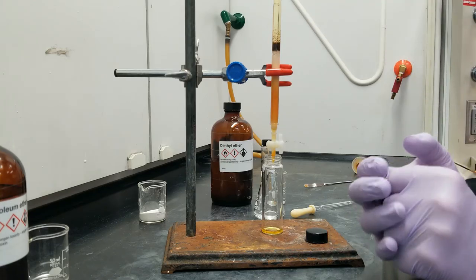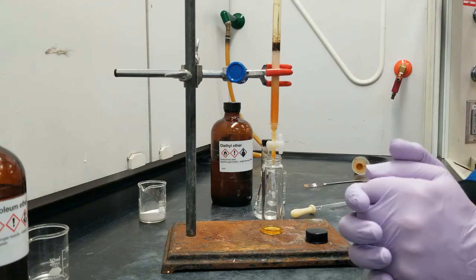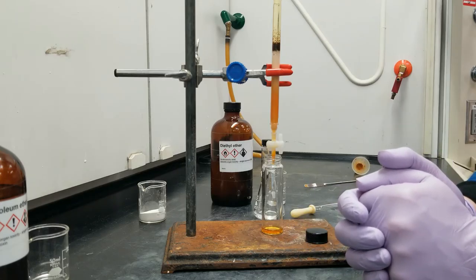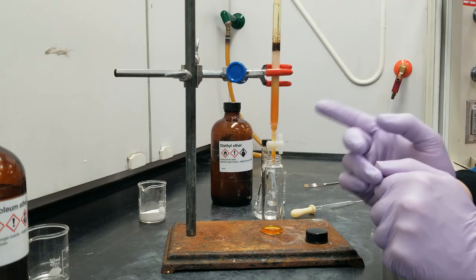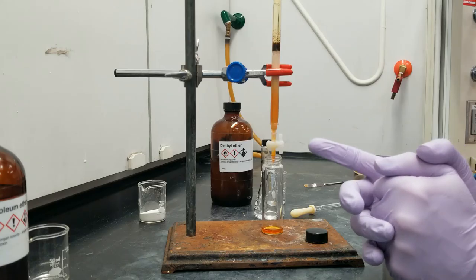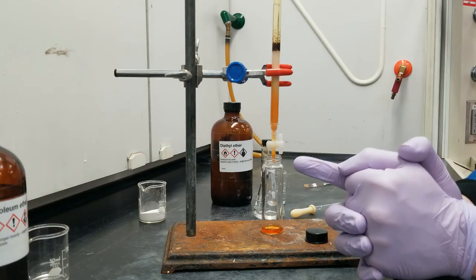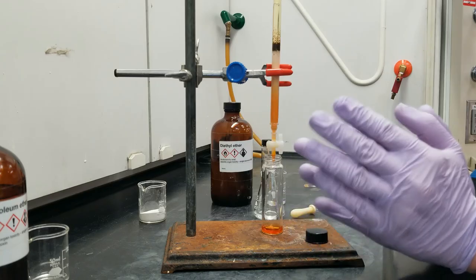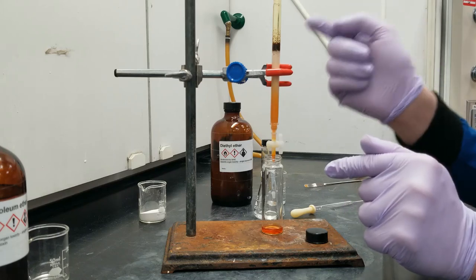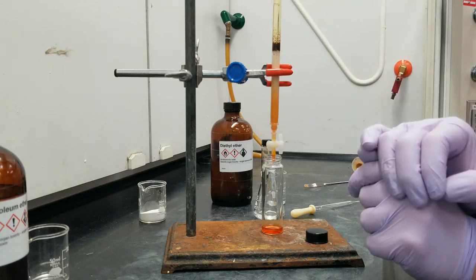What is it? It is diacetyl ferrocene, for the most part, which could be referred to as just polar tars in this type of separation. So a single acetyl group makes the acetyl ferrocene slightly polar, and so we need to use diethyl ether to remove it and get it pushed through the column. Diacetyl ferrocene is more polar. More polar, in fact, so that diethyl ether is not dissolving it very well, and this stuff is not going to move through this polar alumina very quickly at all.